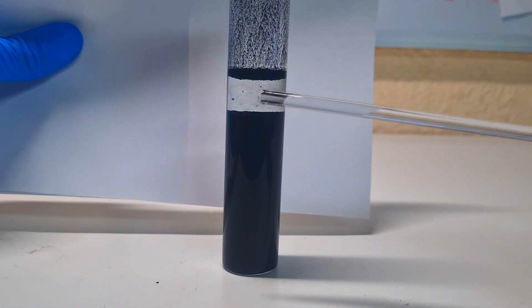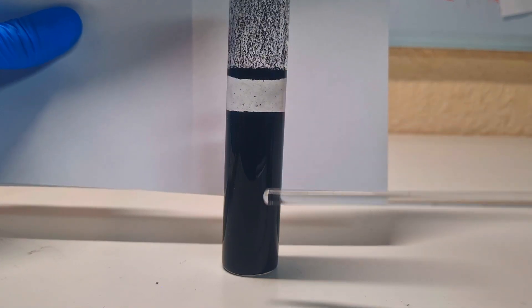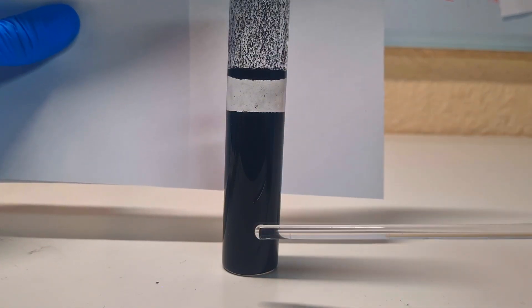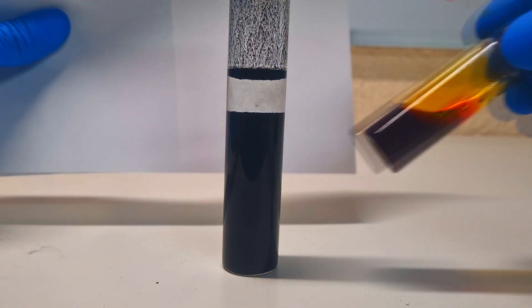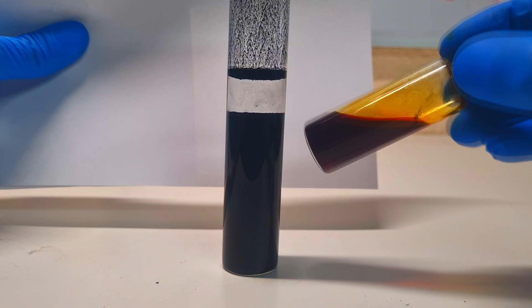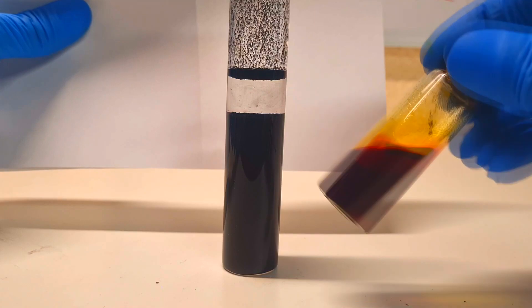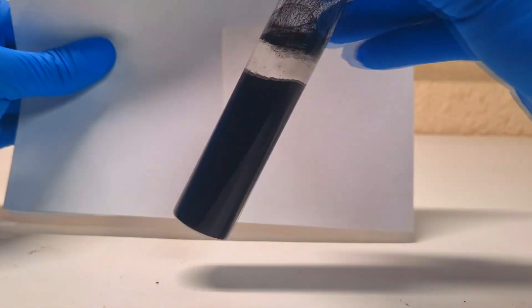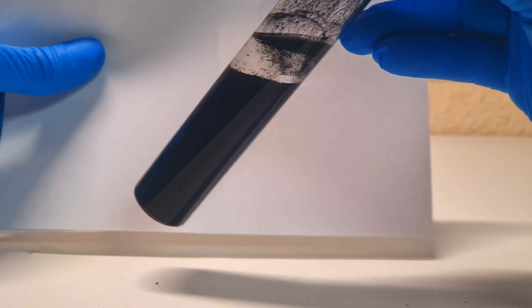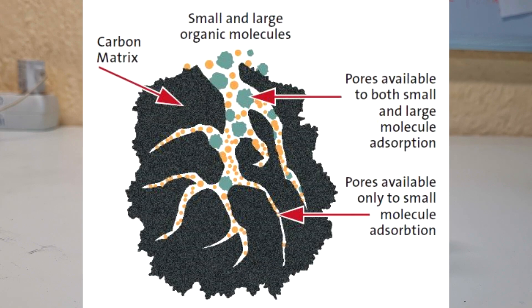And here I get some clear solution, which means that the activated carbon powder absorbs all the iodine. So I get from this red to brownish color to a clear solution. All the iodine was absorbed into the pore structure of activated carbon.